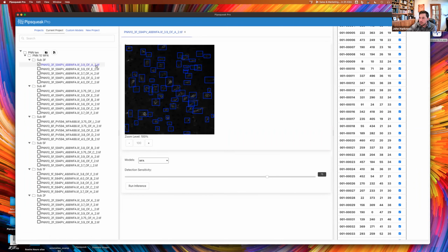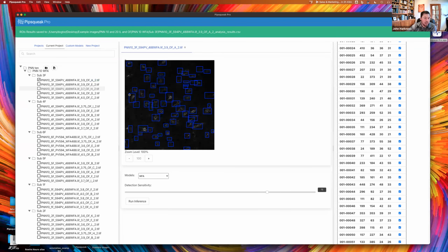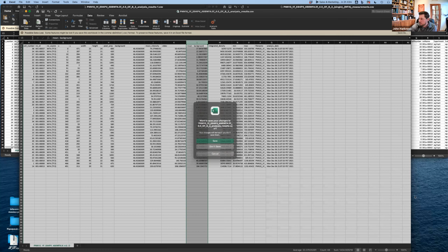Now, I might want to see my results, or even potentially results from somebody else in my lab. The collaboration parts of the program are really important to us. If Christy and I are both working on analyzing this image and we want to compare the results that we're getting, I want to be able to see both my results and Christy's results. So those will be here. What we're imagining is the ability to create some group means right here from this data set, from this image set.